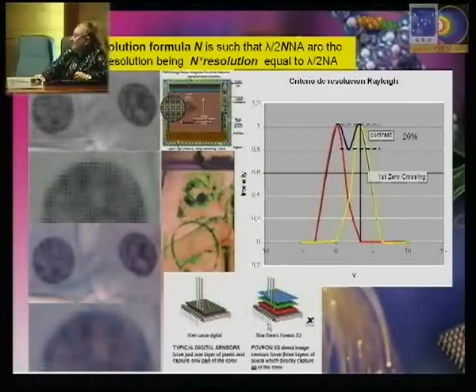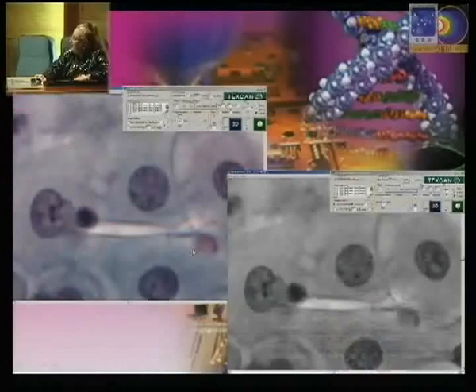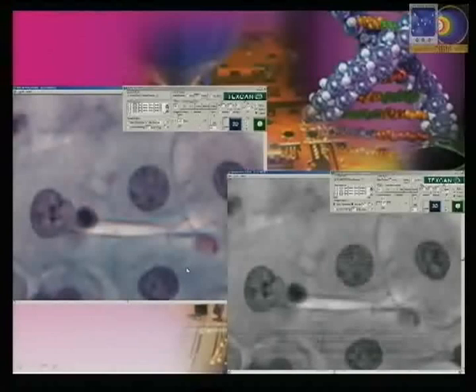The most developed cameras at the present moment are the Foveons, in which you have three layers sensitive to the three colors at the same pixel. Therefore, you don't get this divided-by-3 resolution, but you get a very nice resolution with this type of camera. But these are not very common cameras in the average use in the laboratory.